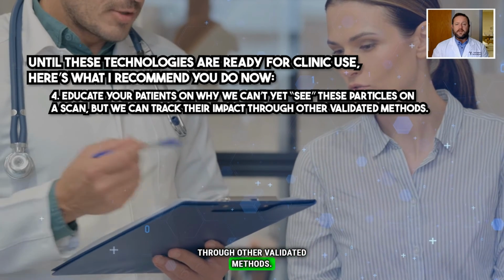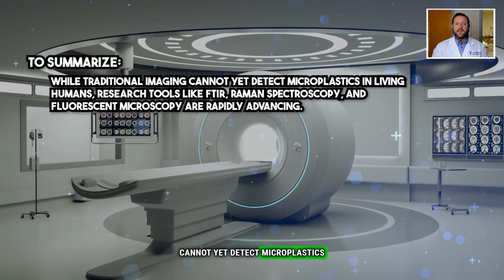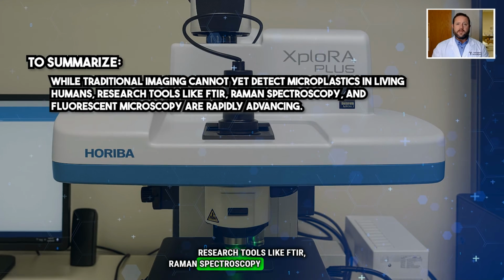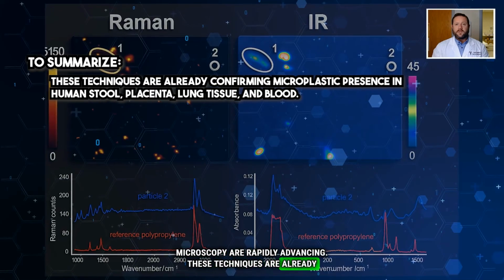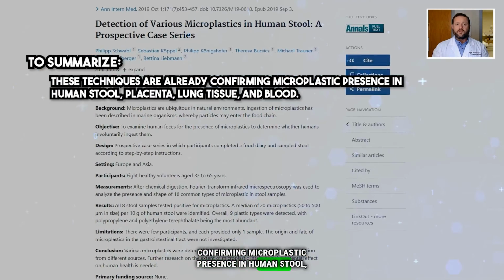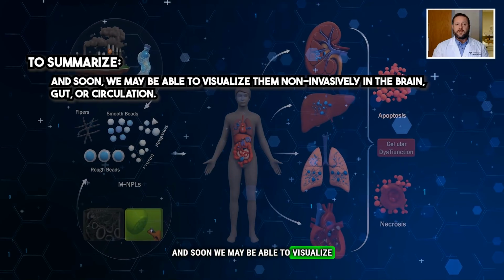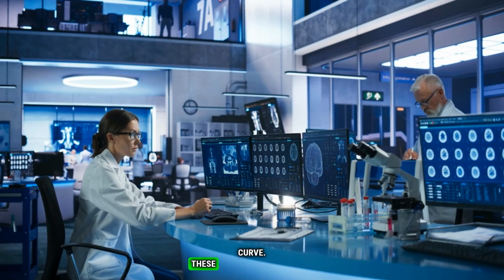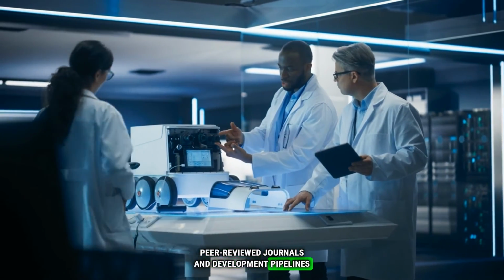To summarize, while traditional imaging cannot yet detect microplastics in living humans, research tools like FTIR, Raman spectroscopy, and fluorescent microscopy are rapidly advancing. These techniques are already confirming microplastic presence in human stool, placenta, lung tissue, and blood, and soon we may be able to visualize them non-invasively in the brain, gut, or circulation. As clinicians, we need to stay ahead of this curve. These tools are not science fiction, they are in pilot studies, peer-reviewed journals, and development pipelines right now.